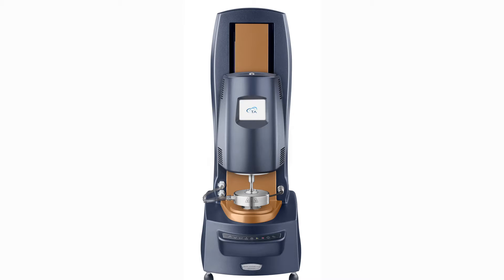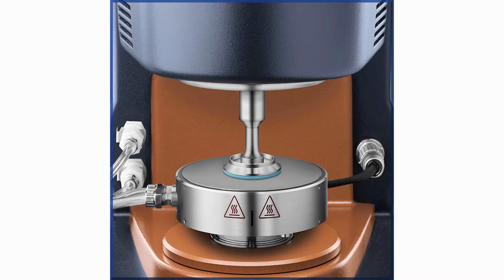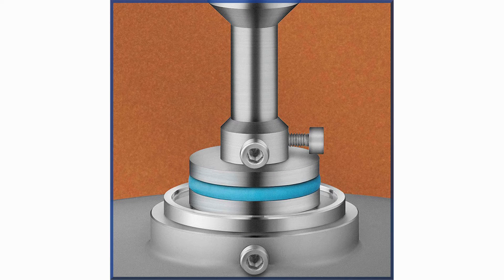To use your immersion ring on a DHR, you will need a Pelletier plate and a standard geometry. This tool is compatible with the standard Pelletier plate, the step Pelletier plate, and the step disposable Pelletier plate.